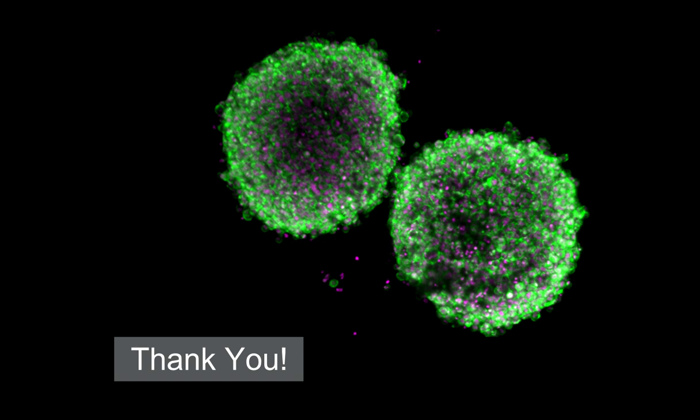If you're using a two-dimensional model of adherent cells, that's very easy because your cells are stuck to the bottom of your dish, so you can be fairly vigorous with your washing and changing of fluids. With these spheroids, they're all just gently sitting in the bottom of the dish.